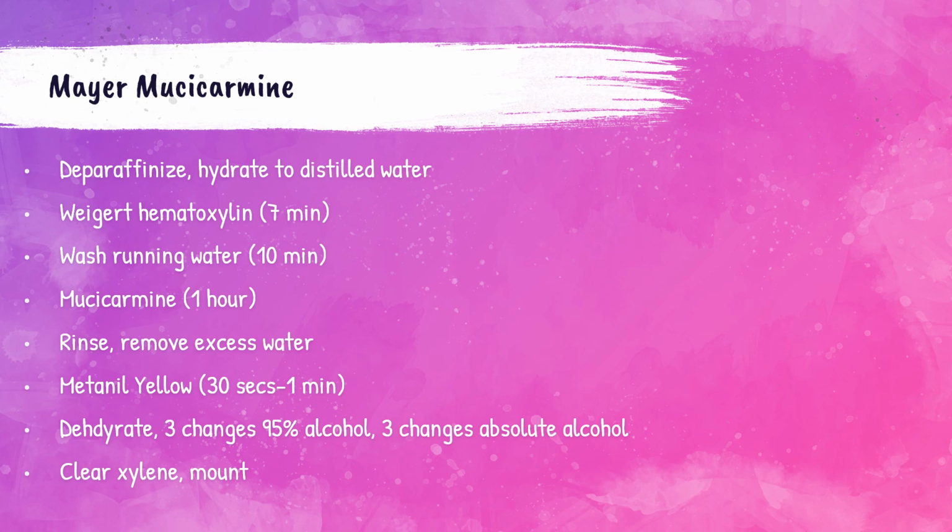The tissue then needs to be dehydrated with 3 changes of 95% alcohol and 3 changes of absolute alcohol. Then cleared with xylene and mounted with synthetic resin.